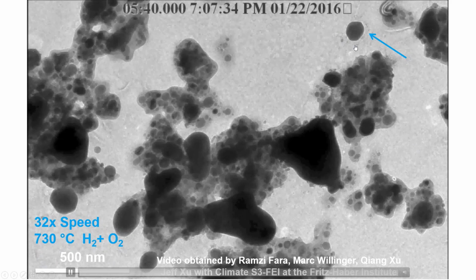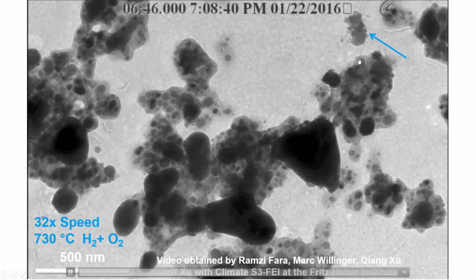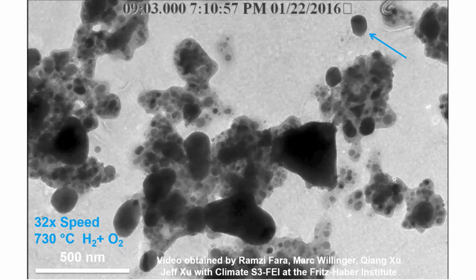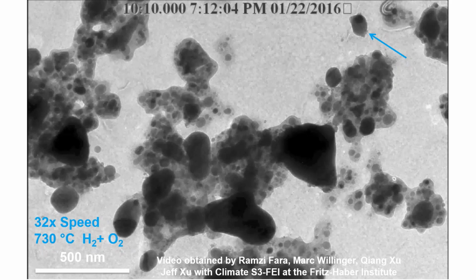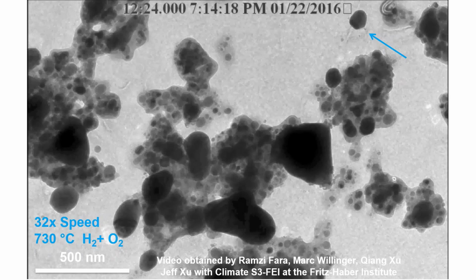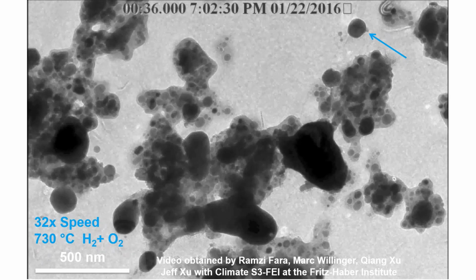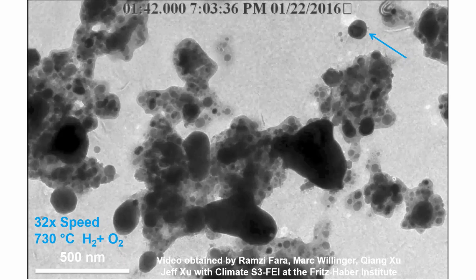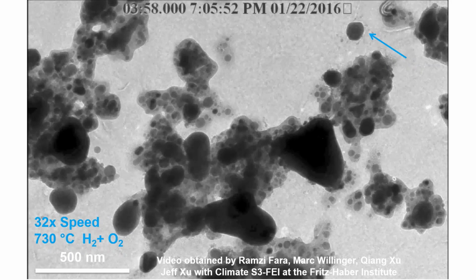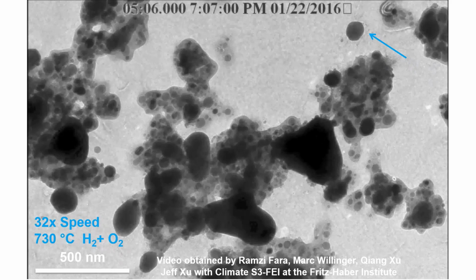Where up at the top right corner of the screen, you can see this particle that's undergoing really very dramatic change in the microscope. This is in a gas environment at high temperature. And there's really very dramatic dynamics that are occurring in part of the sample here.